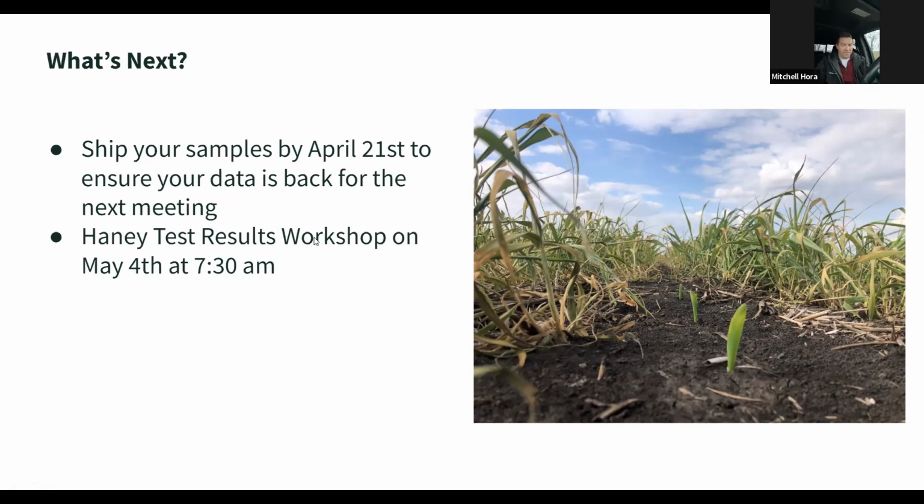One thing I thought of as Carolyn was explaining how to do the samples in the field. If you have an actual soil probe, get 6 inches deep and usually about 10 cores. If you don't have a probe, you can just use a shovel and make your own soil cores by digging down 6 inches deep and taking some slabs of soil, or trying to make 1 inch by 1 inch columns of soil to resemble what a probe would do. We take those soil cores, or some of the soil from the shovel, and put it in a bucket, so that you can mix and homogenize that soil, and then dump it into the bag.